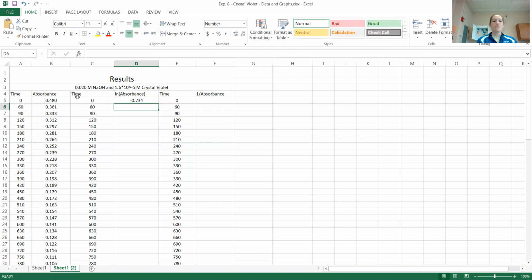Now, you would like for all of this math to be done. You can actually do it one of two ways. You could go Control-C, highlight, Control-V, and it'll plug it in. So now all those have been plugged in for me.